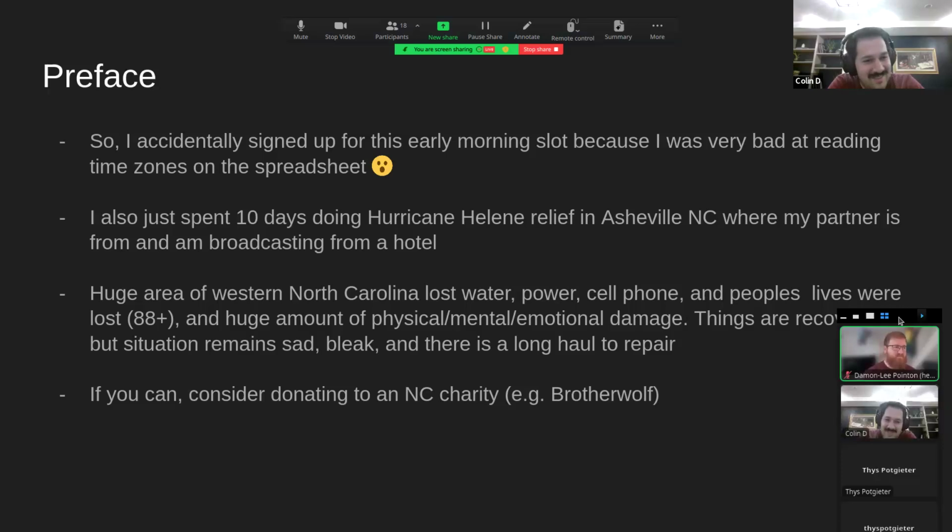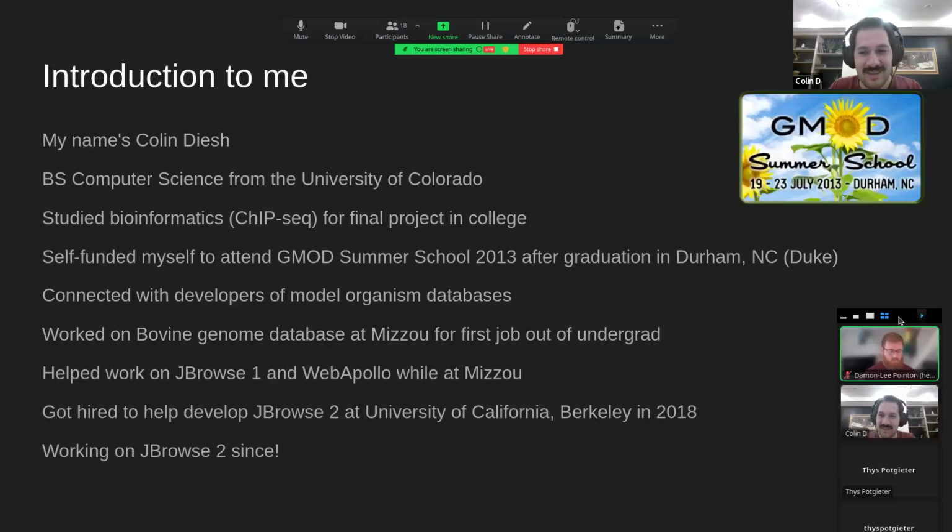So that's where I'm at. I'm happy to go over that more, but I'll segue right into the theme of the talk and give myself a little more background, which is that I'm Colin Diesh, and I got into bioinformatics just kind of randomly through a final project in college, undergrad. After graduating, I didn't really know what I was going to do, but I felt like I wanted to stay involved in bioinformatics.